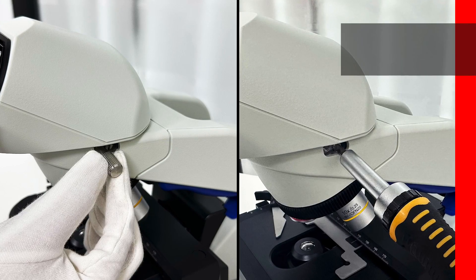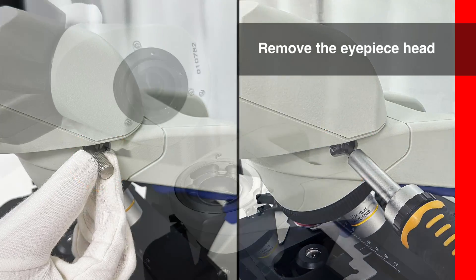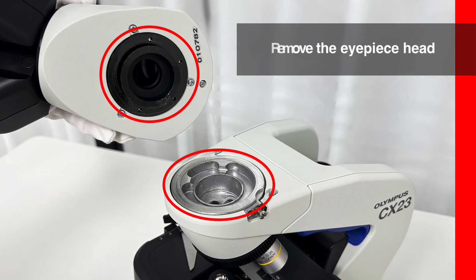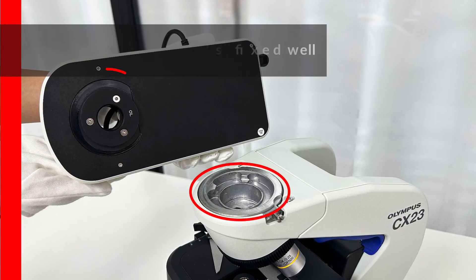First, we use a flathead screwdriver to remove the eyepiece head of the Olympus CX23. Next, we will install the camera.